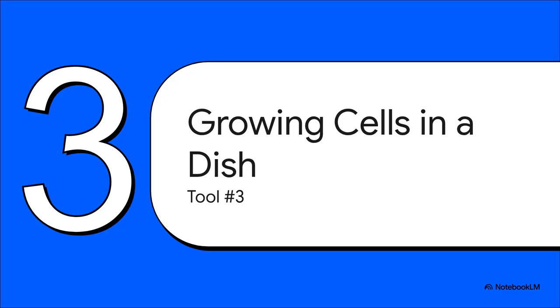All right, next tool in the box. You've seen your cells, you've sorted them. Fantastic. But here's the thing. For most experiments, a few thousand cells won't cut it. You need millions, sometimes billions. You need to grow yourself an army.